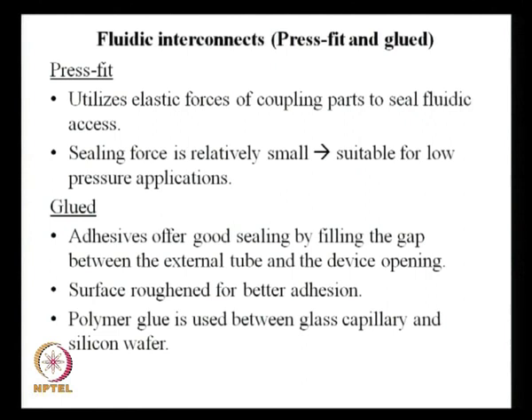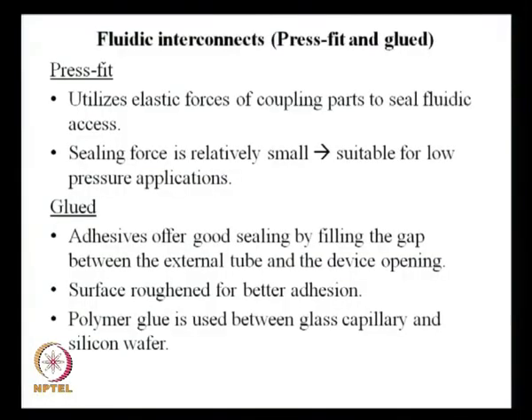So, these press fit arrangements are very popular as long as you are working with a low pressure system, because it is more of a case of just taking this and pressing it in, with a little bit of force, and the interconnect will go in and seal. However, it can seal only up to a certain pressure. The other method is what you call glued.